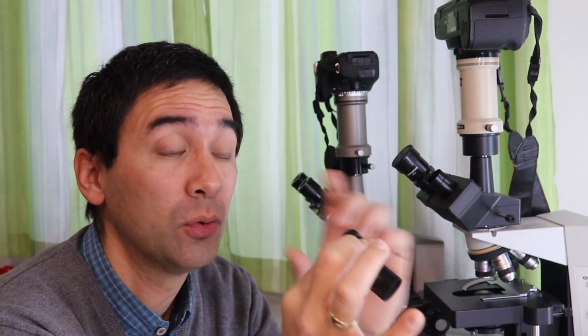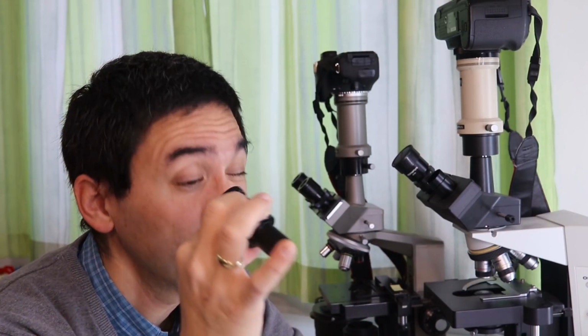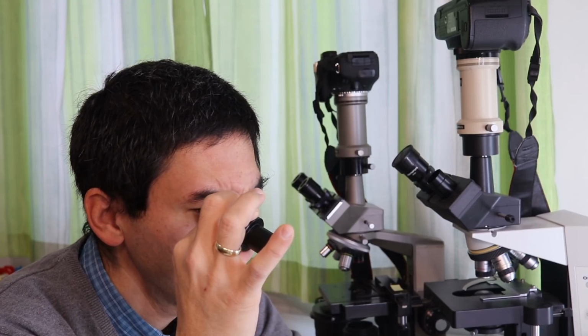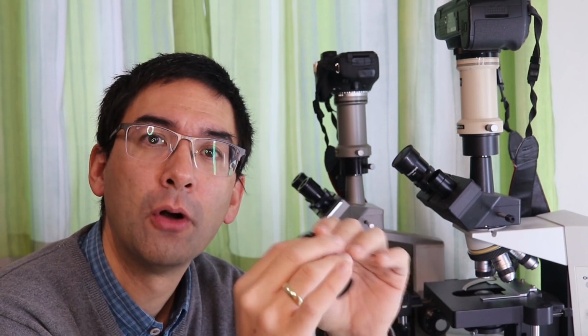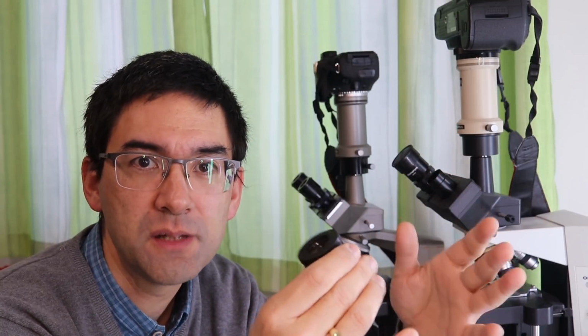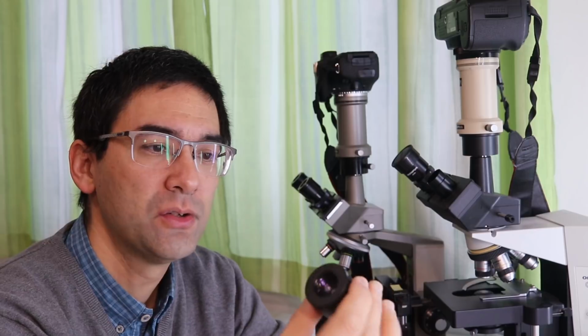It's difficult to find, and in order for me to find the correct eye distance, you can extend the front part, and then I can still rest the front part on my eyes, and have the correct eye relief distance. So if you wear glasses, get yourself eyepieces with a large eye relief, because then you can look at the specimen without having to take off your glasses, okay? So that is another thing.